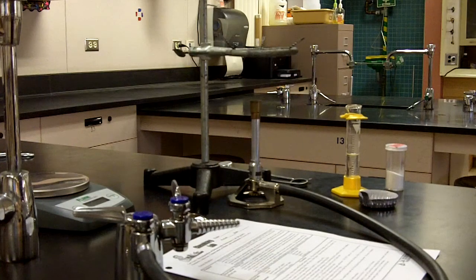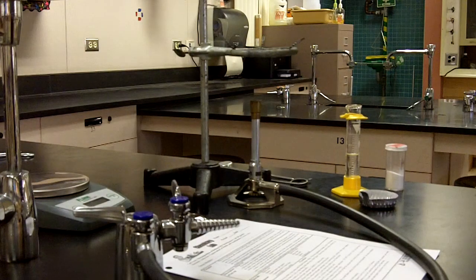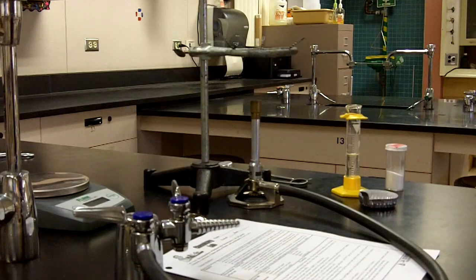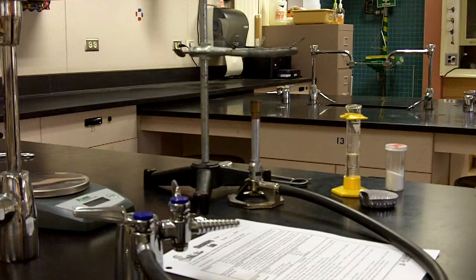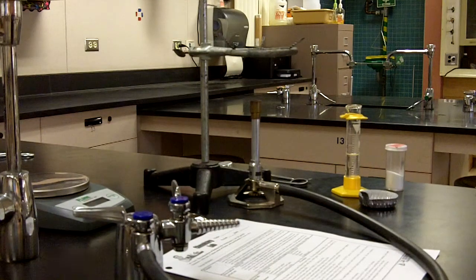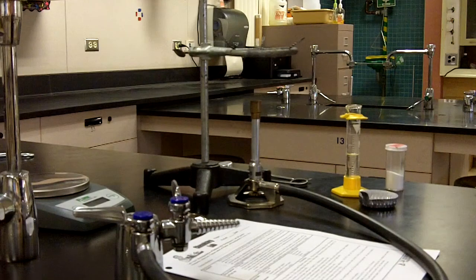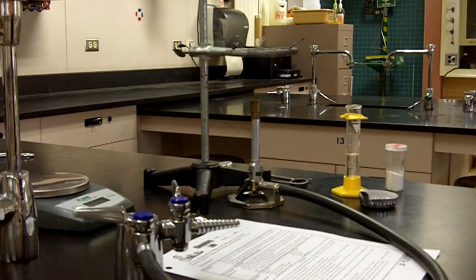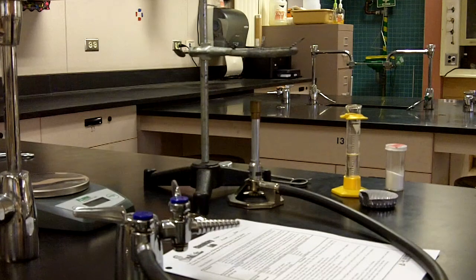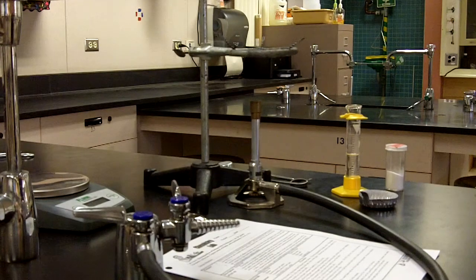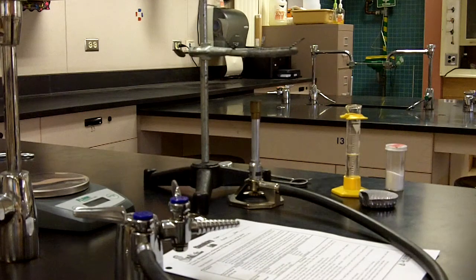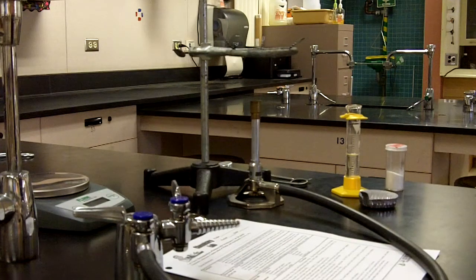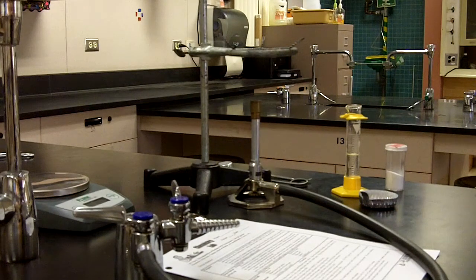The description of setup. Stoichiometry is a method chemists use to determine the amounts of reactants necessary to produce a desired amount of product. Stoichiometric equations also give chemists valuable information about the quality of the experimental design by comparing the theoretical yield to the actual experimental data collected in the lab. While doing this activity, look for possible design errors and explain any differences in the numbers.